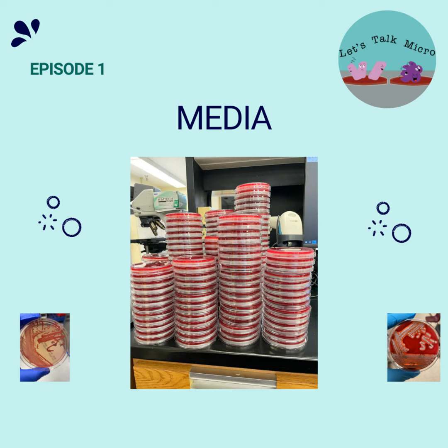It's very crowded sometimes, depending on what kind of infection you have, especially if it's contaminated, based on the source. You get a lot of skin flora. Sometimes you have patients that have these infections on the foot with multiple gram-negative rods. So you want to achieve that isolation. It's very important. And then you have that quantitative culture, right?